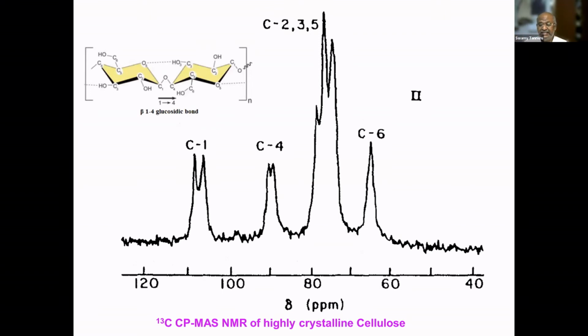This is a natural polymer. In fact, currently highly crystalline cellulose is gaining a lot of importance because it is a natural resource. In NMR, crystalline systems will give sharp signals, whereas amorphous systems will give very broad signals in spite of applying high resolution. The reason is that in crystalline systems, we have long range positional and orientational order. In amorphous systems, order is not there. This order contributes to better spectral resolution. Here I am showing the cellulose signals. Because of the separation of the signals, the well resolved spectrum lets you easily identify all the carbons in the system.